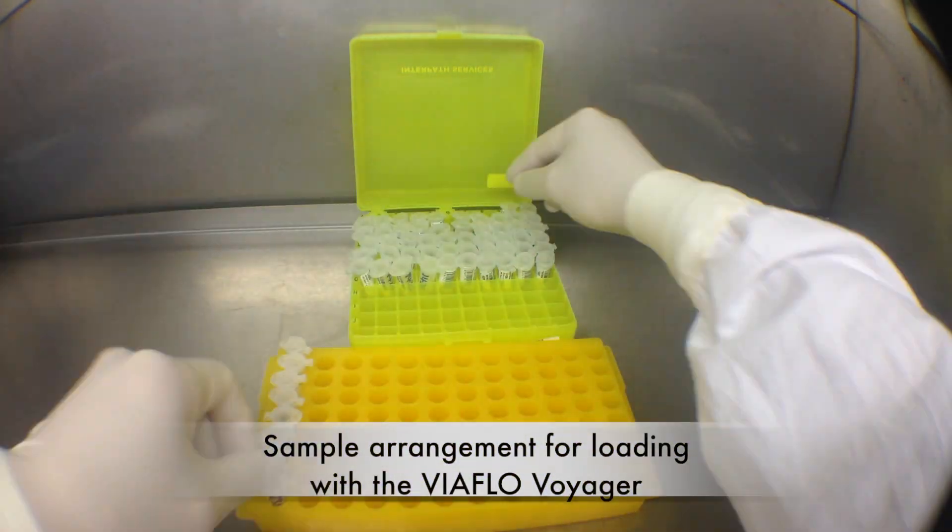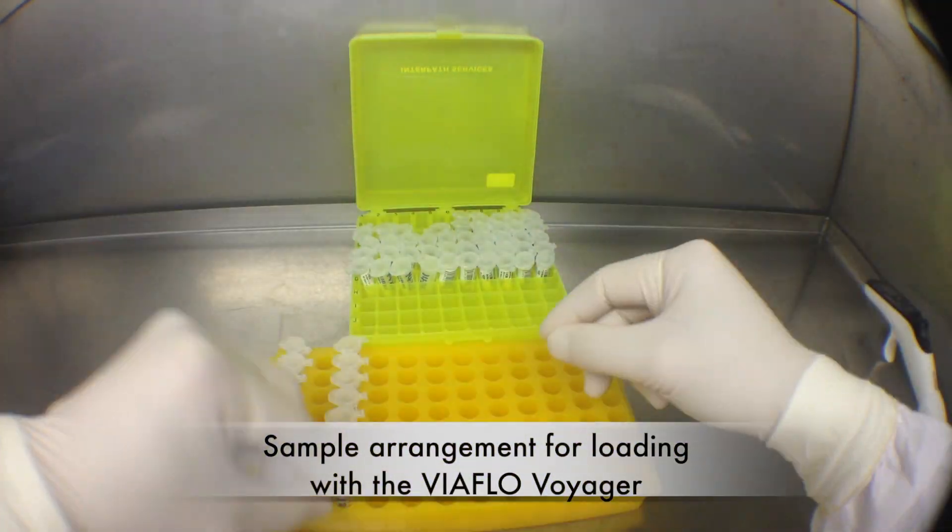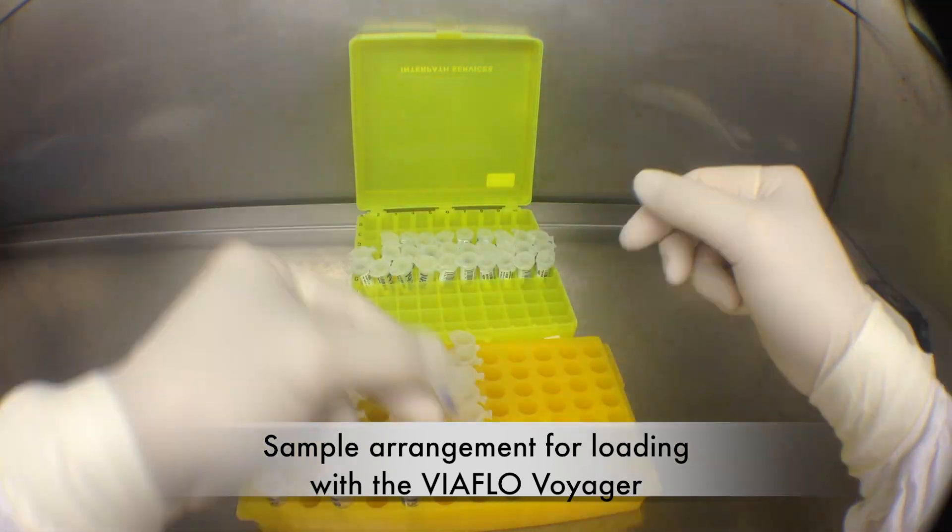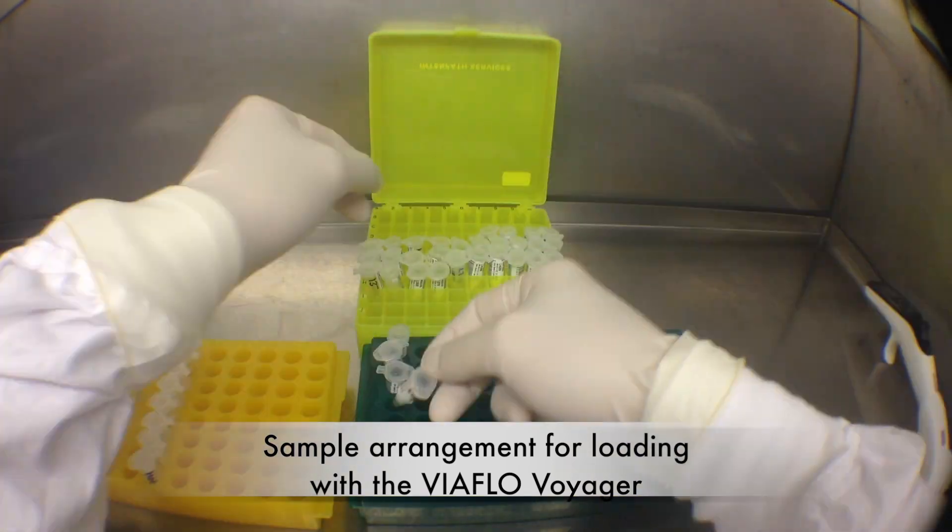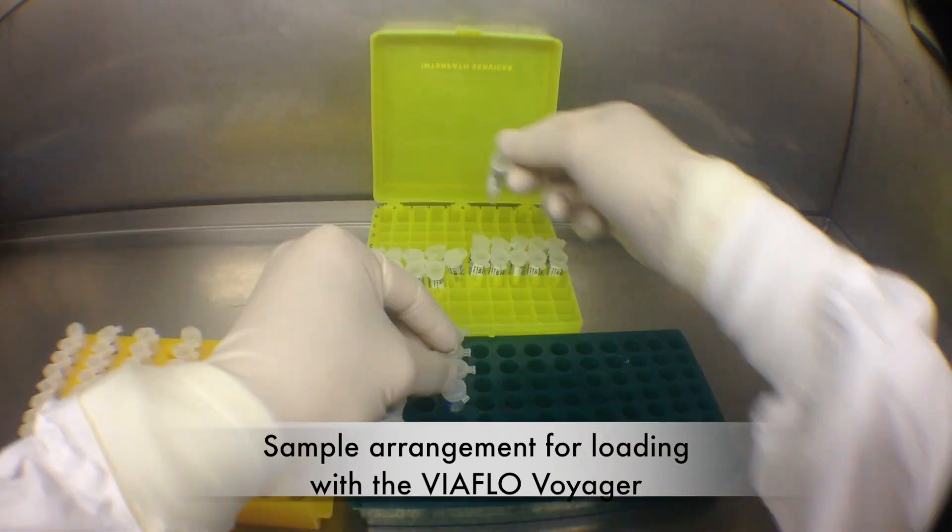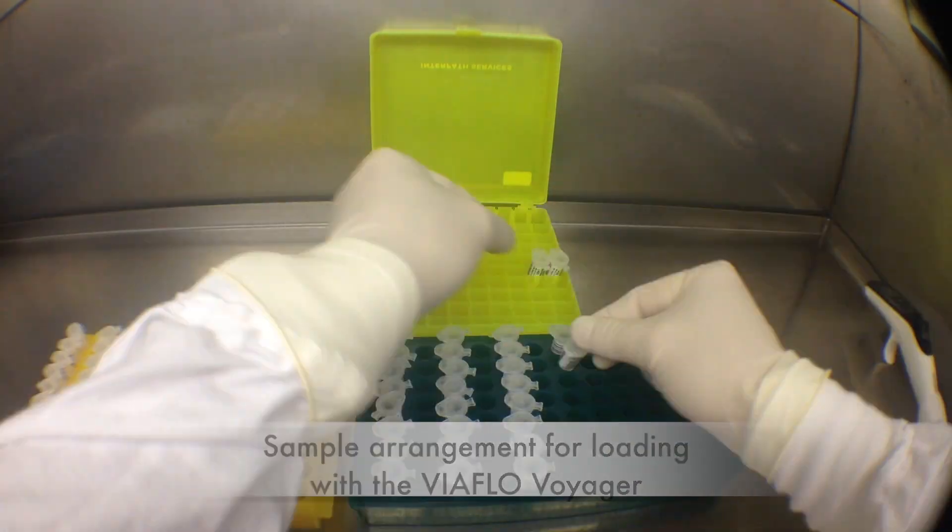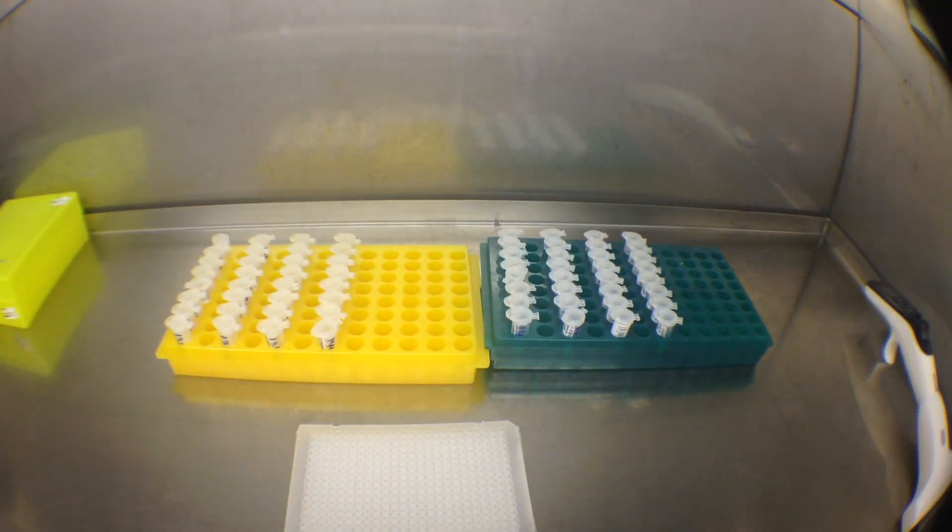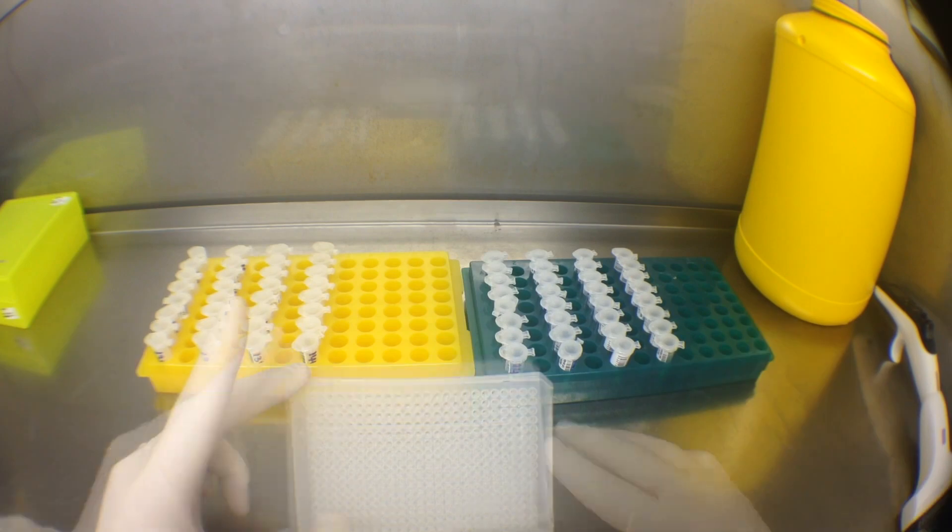Next I need to get my 64 samples all lined up in Eppendorf tube racks ready for the VioFlow Voyager. This is a pipette that has adjustable tip spacing. I'll be able to pick up samples from these tubes and then drop them off into the 384-well plate.